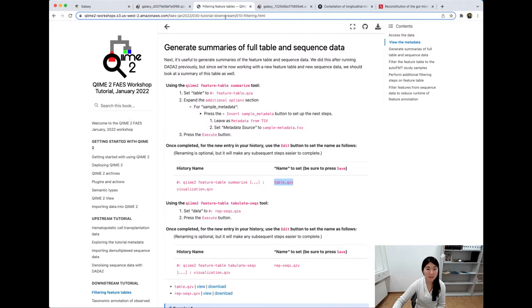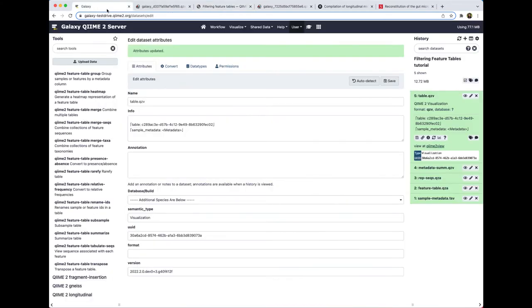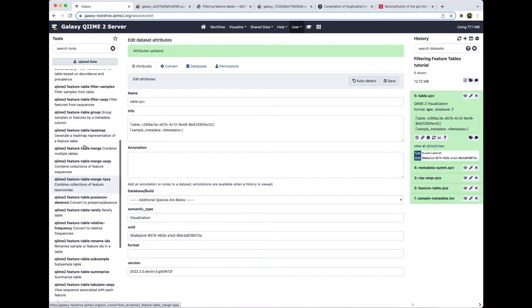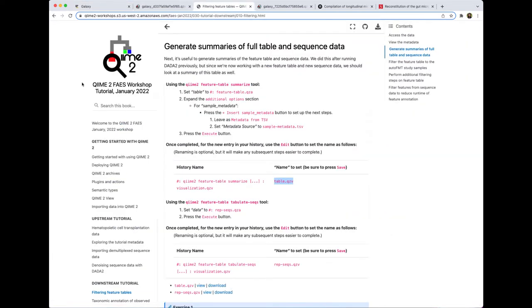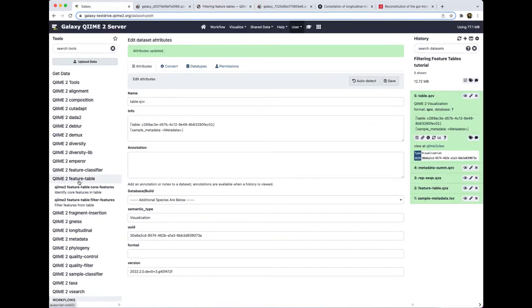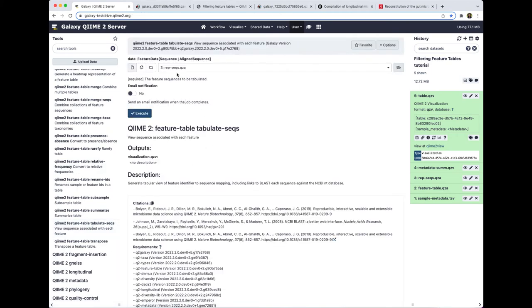So we just created a summary for the feature table. Next, we're going to tabulate sequences — create a summary for all of the sequence data that we have. We want to run QIIME 2 feature-table tabulate-seqs. Let's head back to our Galaxy tab. We're going to look for QIIME 2 feature-table tabulate-seqs. We are going to run this with the rep-seqs.qza file, and we don't need any other parameters — just click execute.